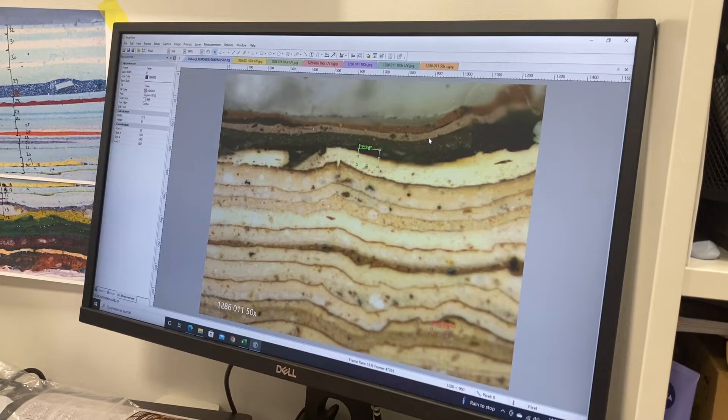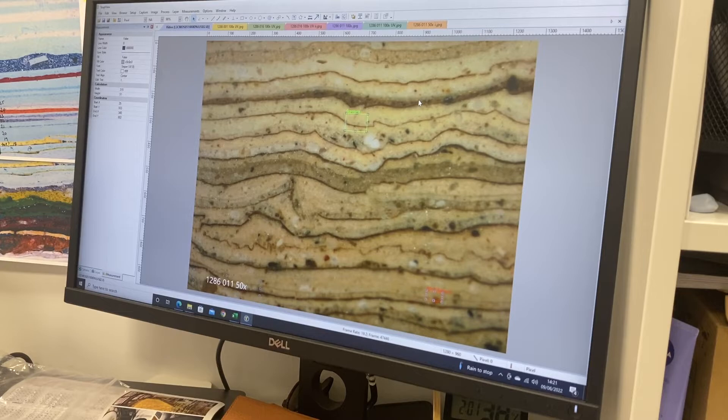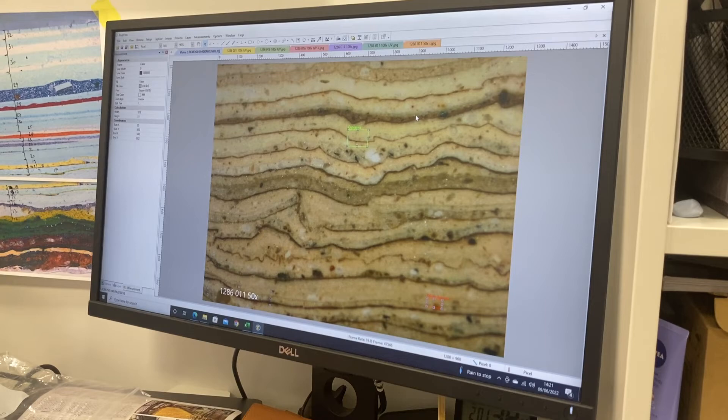Before then it was stone color right back, obviously with the graining layers. Although you're seeing the main body of the layer as pale because of the very thin pigments over the top, it ends up being dark as we know from what Ian's working on. But the layers themselves, because they're varnishes and very thin layers, are quite hard to see in a cross-section — but you can sort of see them in the centre there.